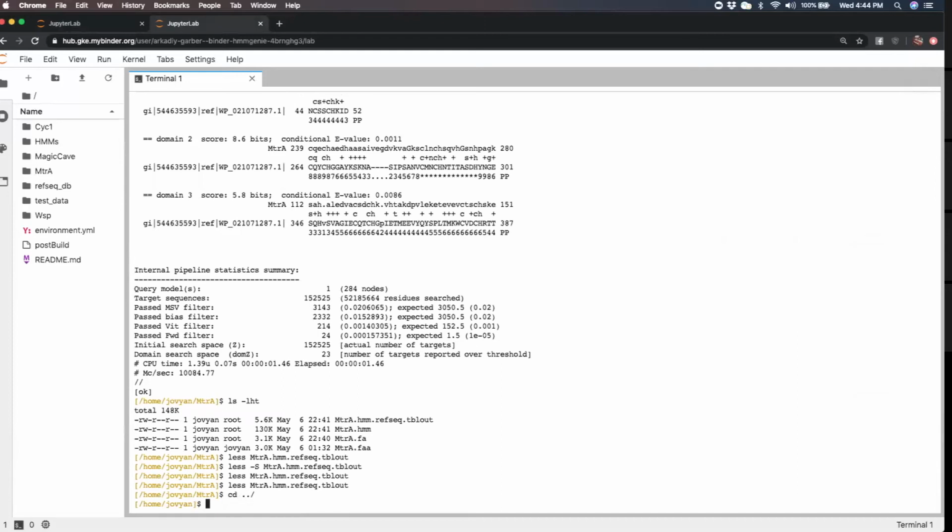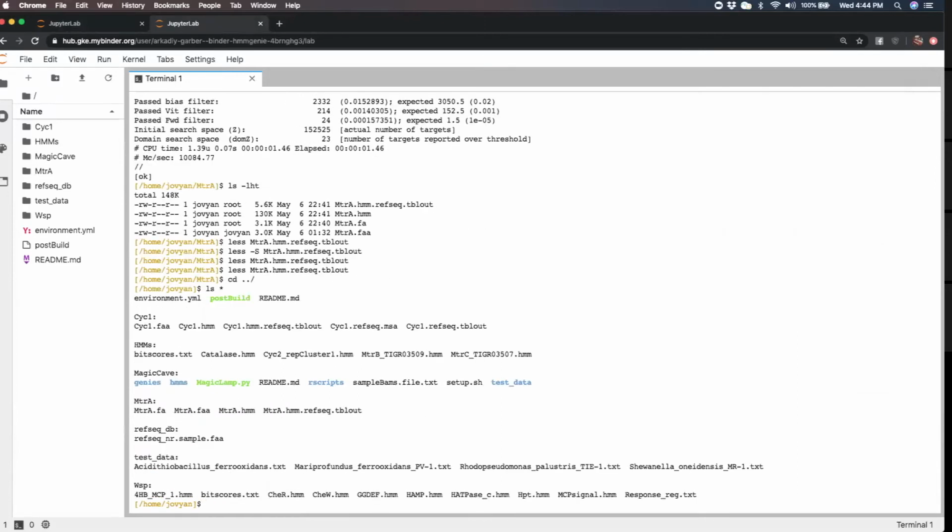Okay. So now that we have the HMMs for Cyc1 and MtrA, we're going to put these in the same folder as the rest of the HMMs that I have preloaded on here.